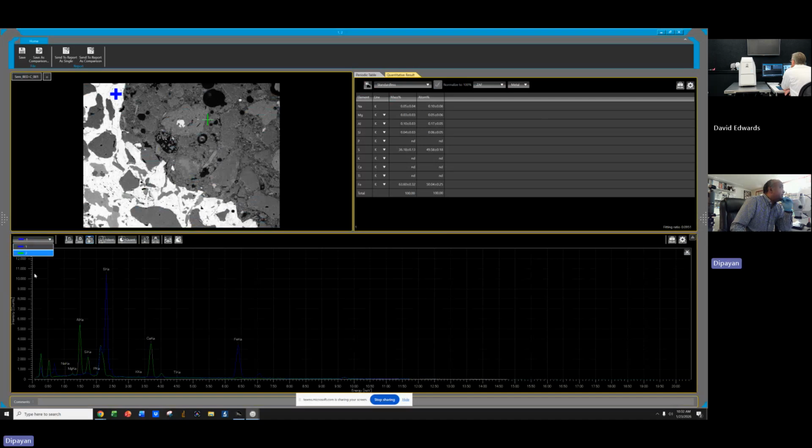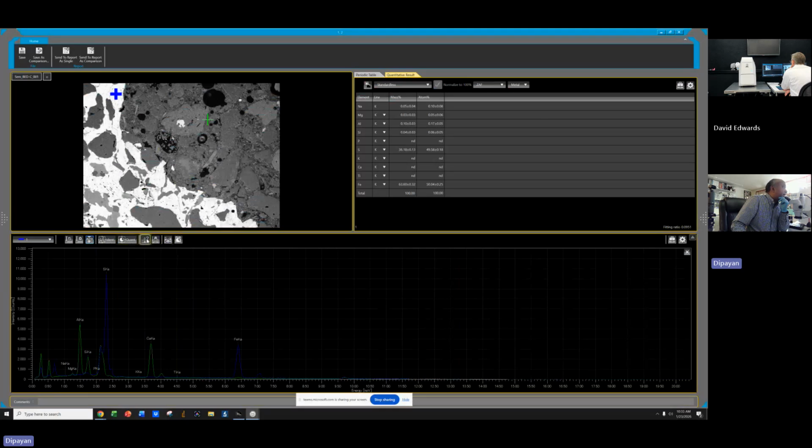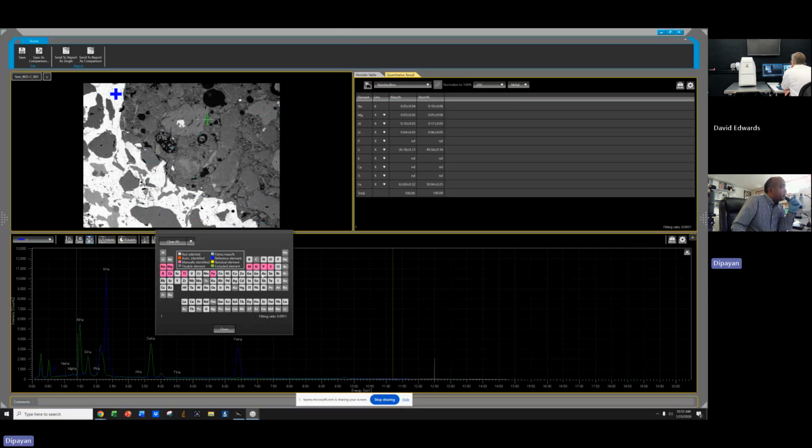If I had 10 runs, every time I had to select, so what I was doing is I was going to the periodic table, removing the gold, and forcing whichever elements I need. After I do that exercise, I was then going to the metal or oxide. Then I was physically pressing quant. If I don't do that, all the elements I chose won't show up in my report.